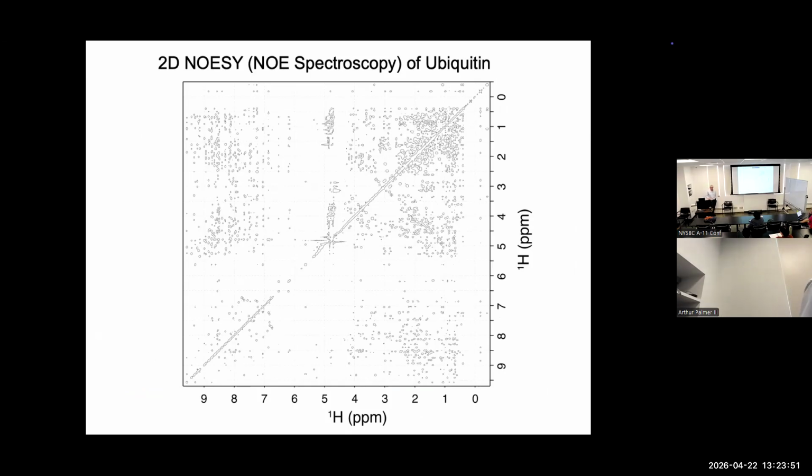I'll add it in. Wüthrich in the early days went through crystal structures and tabulated all the distances you would expect to see for consecutive amino acids, out to about 5 amino acids down the covalent chain, depending on whether the molecule was beta sheet, alpha helix, or loop, so that you would know when you were trying to sort out the connections what you expected for the short and medium range NOEs.